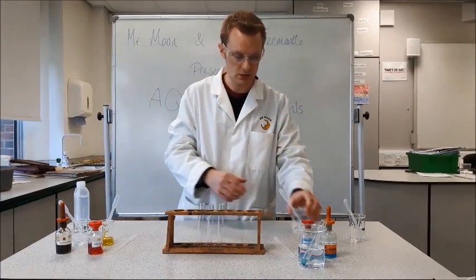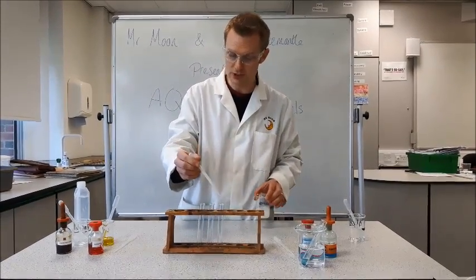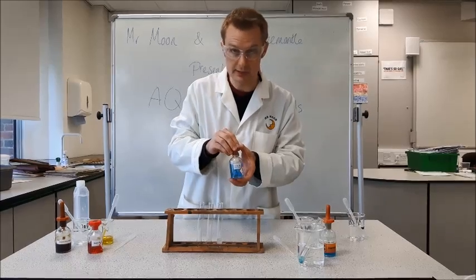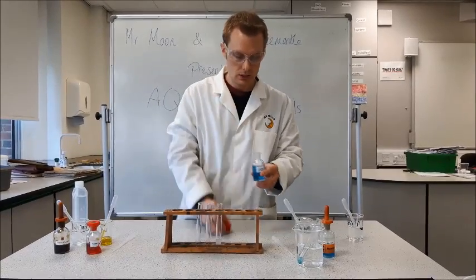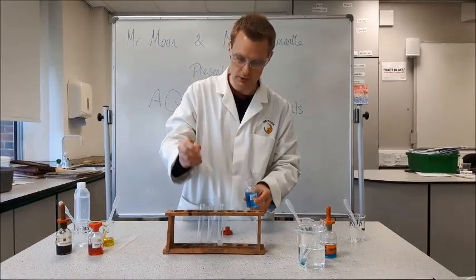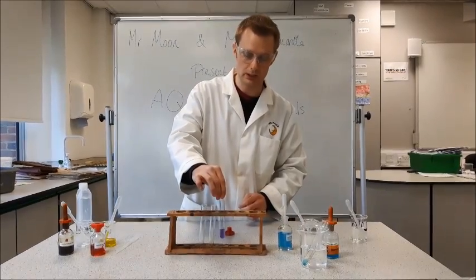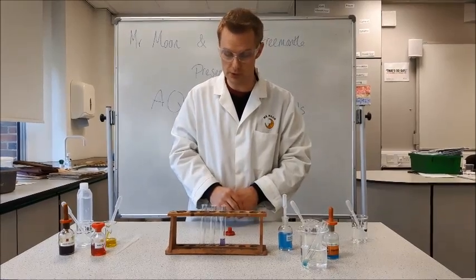The next test I'm going to do is for protein. So I've got some albumen, which is egg white. I'm going to put that in my test tube, and then I'm going to add some biuret solution. Again this starts off as a blue colour, but this time the colour change we're looking for is quite different. I'm going to add about 2ml, and you can see an immediate colour change to lilac or purple — that is the positive result for protein.